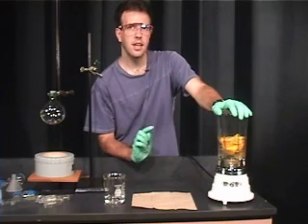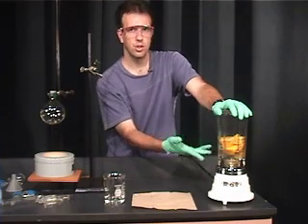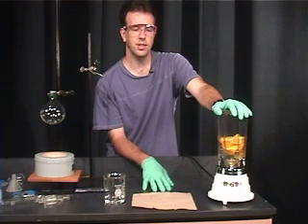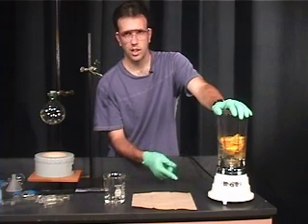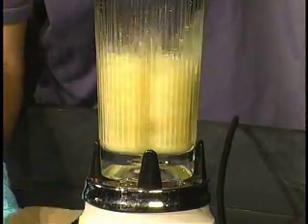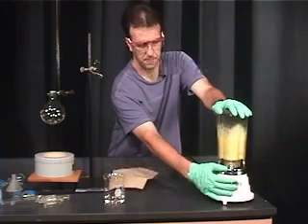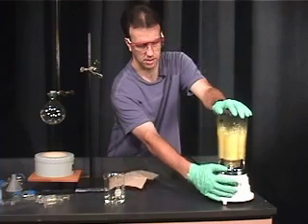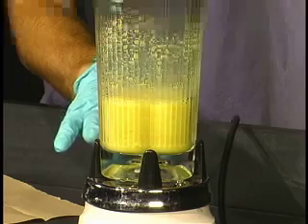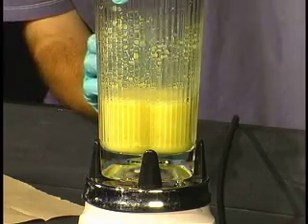In my experience with this, you want to make sure that you've blended it fairly well. Otherwise the orange solution will not go through the powder funnel when you attempt to add it to the 500 milliliter round bottom flask. It's better to blend too long than not long enough. What you should end up with is what looks like an orange shake with very small pieces of orange peel floating around in it.